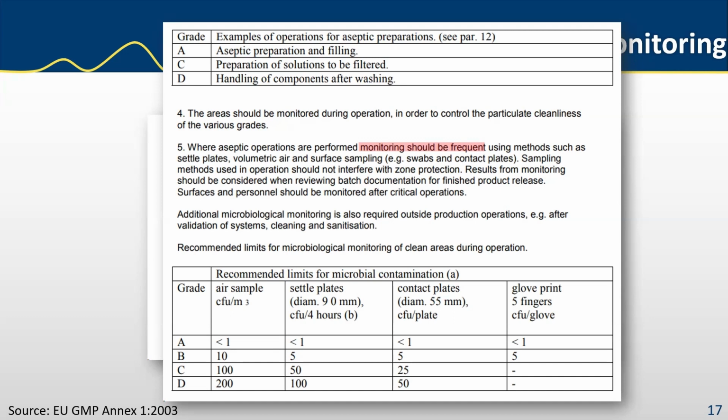Most companies would do a pre and a post with their microbial sampling, so they'd have pre-post data. Monitoring continuously during the process does cause some challenges with the technology. And you also want to limit the frequency that you're changing out your media dishes as well.